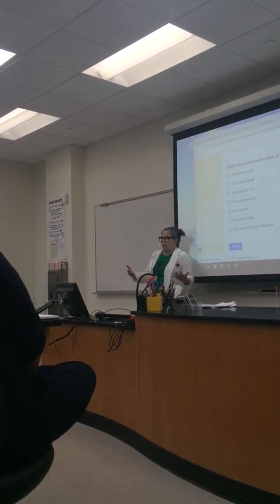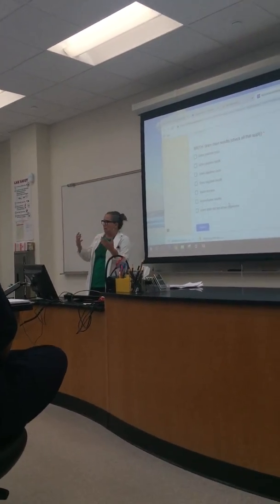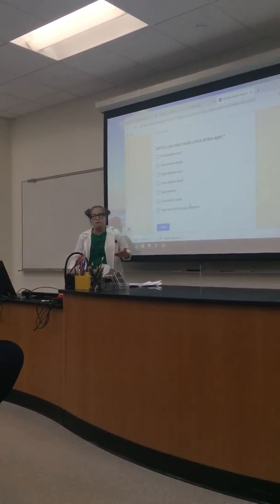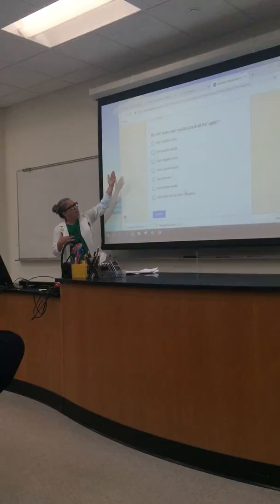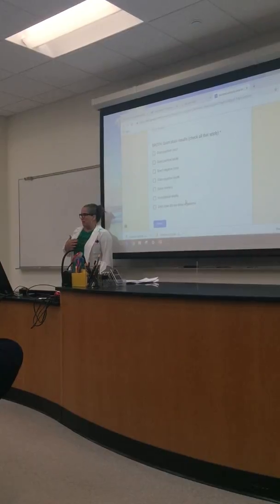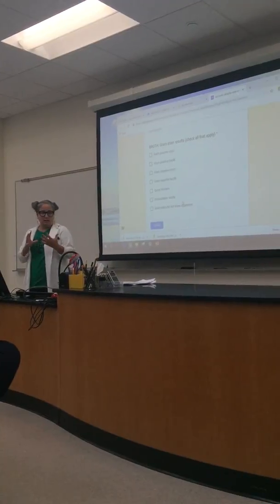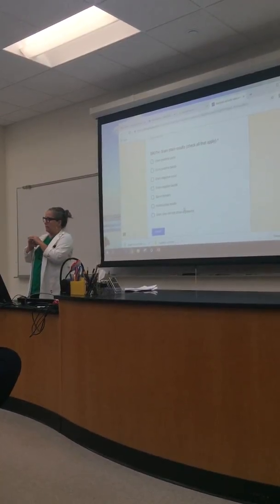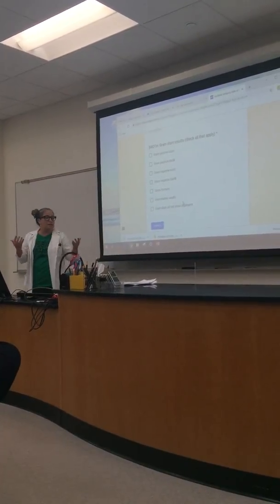If you did the gram stain and there were no organisms, there was another person that had that, right? They had very little turbidity in the broth and we couldn't get anything on the gram stain. So everyone will check at least one box. And then those of you who got results, if you got gram-positive cocci, you will check that box, gram-positive bacilli, gram-negative cocci, gram-negative bacilli, spore formers. We have lots of spores. And I know you're thinking, well, spores, we haven't done spore staining, right? But because a spore is really highly resistant to penetration, the gram stain reagents, the stains can't get into it. So we had a lot of people that had purple cells with a clear oval inside them. So you will choose those things, click submit.